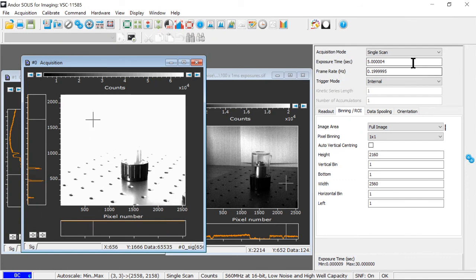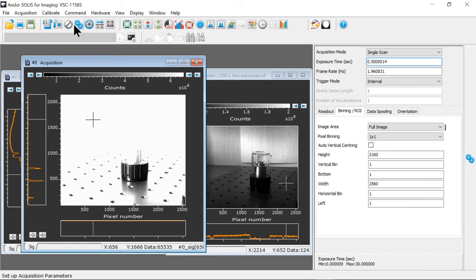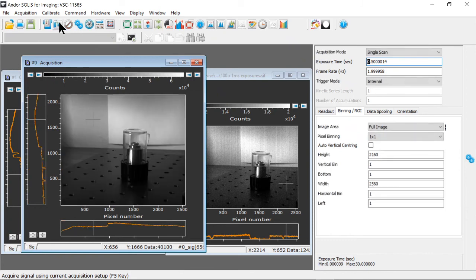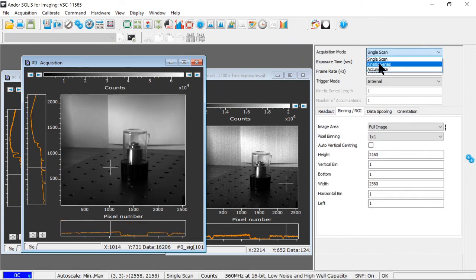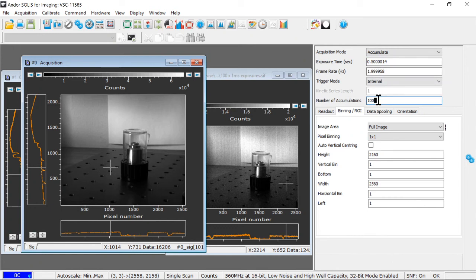However, if I wanted to collect more signal using accumulation mode, I could go back to 500 milliseconds, where I still have the sensor's pixels not overwhelmed with light. And I could set up an accumulation and collect 10 exposures to give me the same effective exposure time.